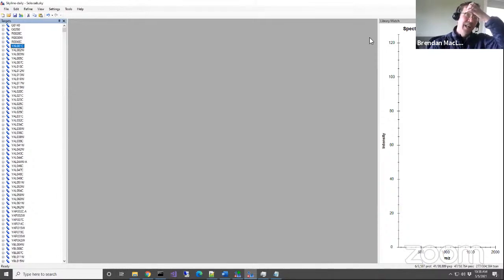And the processing in Skyline Batch is going to be a little bit more complicated today, but thankfully there's a way to save configurations and restore them right into Skyline, and I'm going to hand things over to Ali to talk about that. Thanks, Brendan.